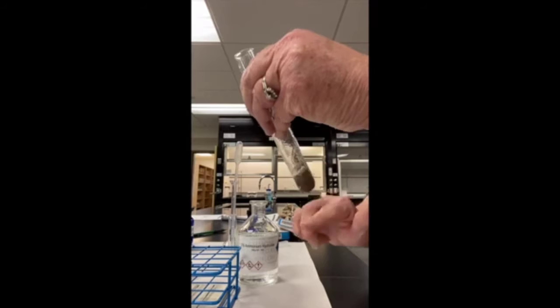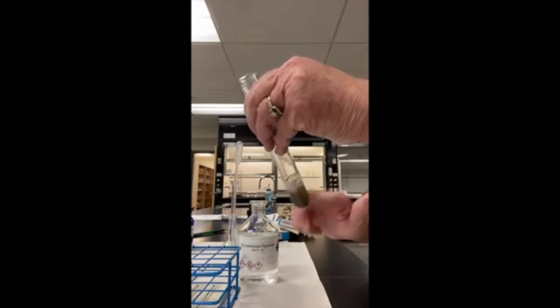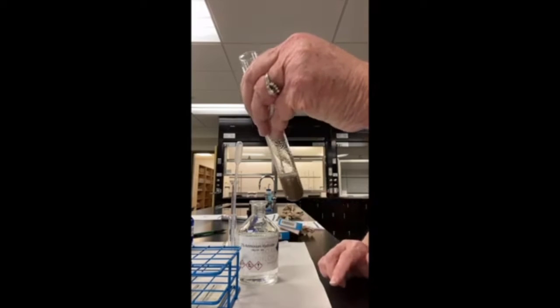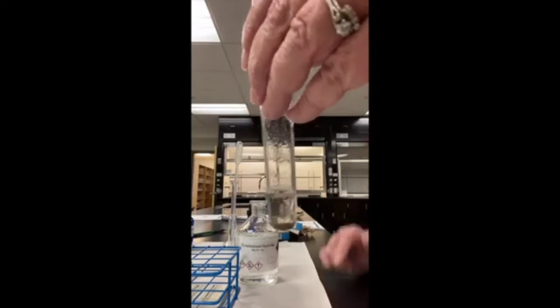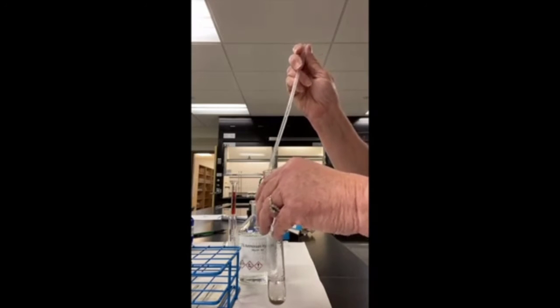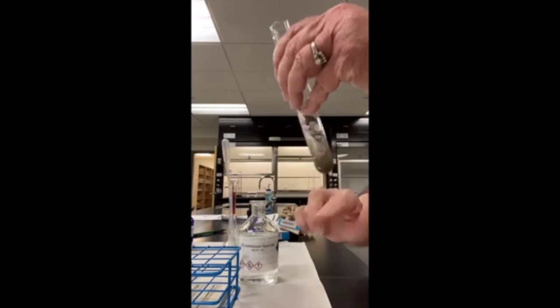We've got a lot of the precipitate. Notice how it's going to the bottom, and then it's much more clear at the top. I'm going to go ahead and add about 5 more drops, because I don't want to put too much in there.